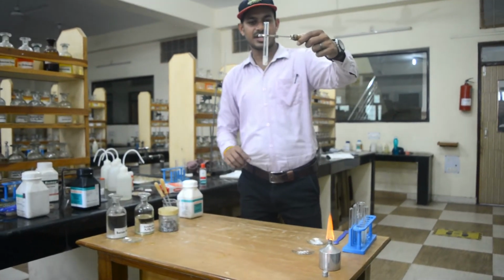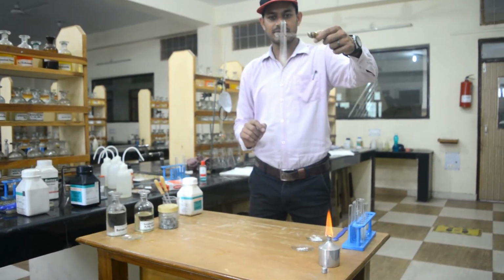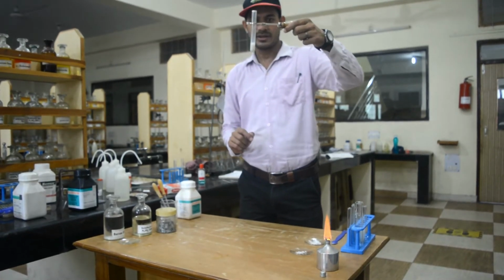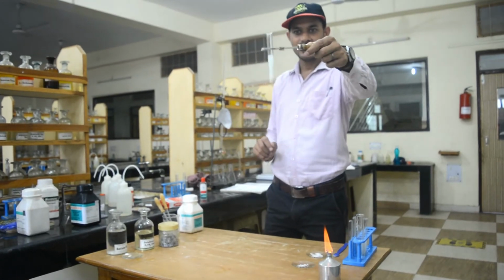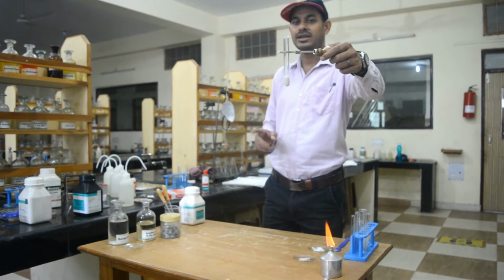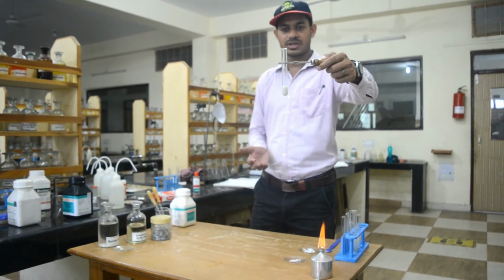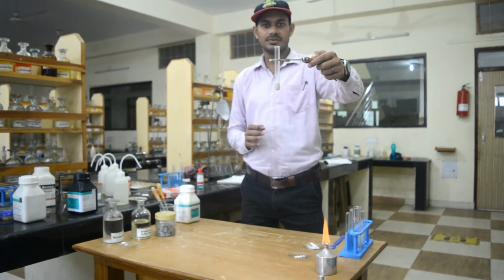You can see the reaction is taking place between these two. Barium chloride when it reacts with sodium sulfate forms barium sulfate, which gives us a white precipitate. Now you can see the white solution forming in the test tube. This is the double displacement reaction where barium is displacing sodium and sodium is displacing barium simultaneously, at the same time. So these are a few of the different types of chemical reactions.